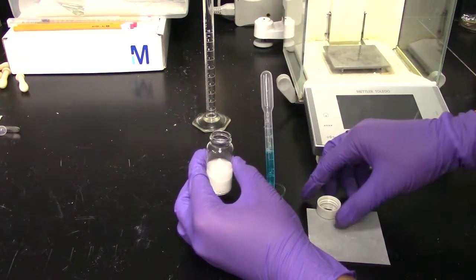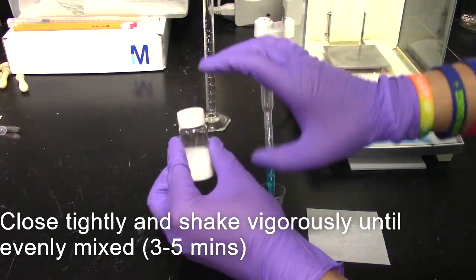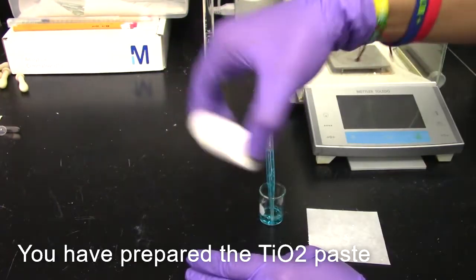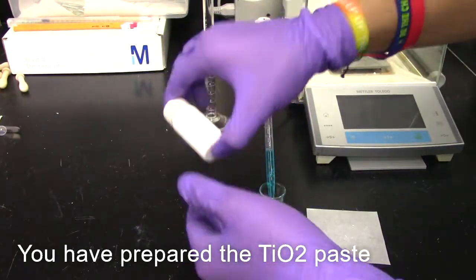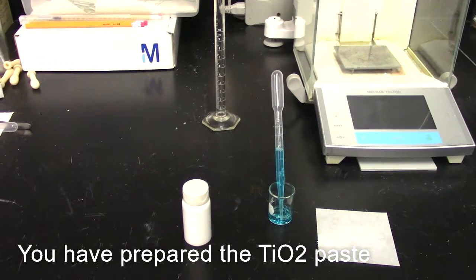After adding 2 to 3 drops, close the vial tightly and shake vigorously until evenly mixed. The TiO2 paste should have a relatively viscous and slurry consistency.